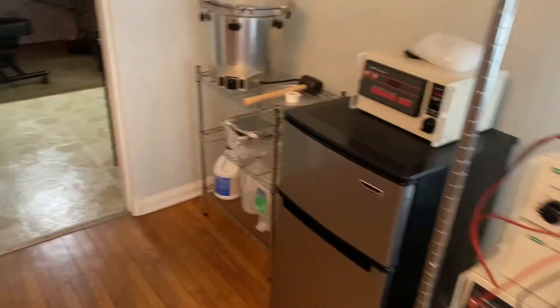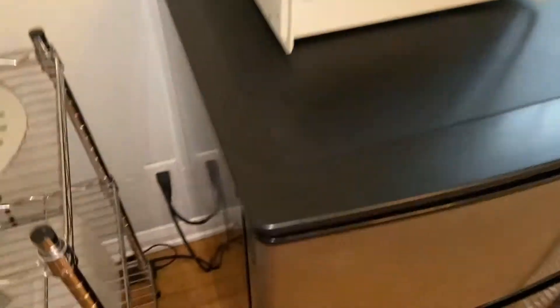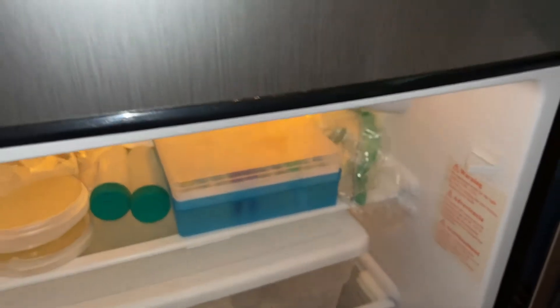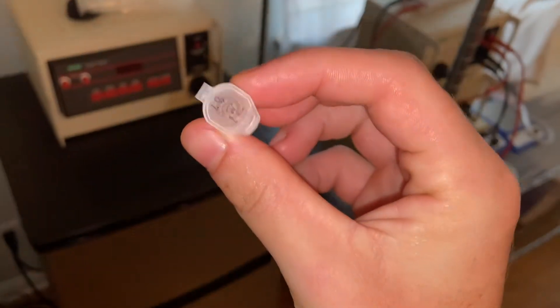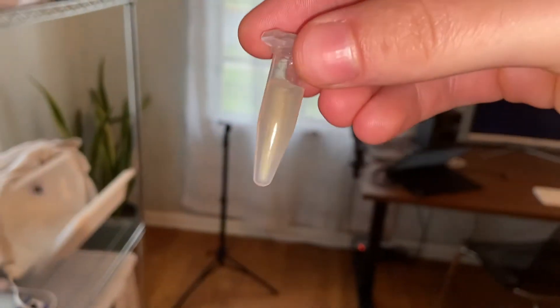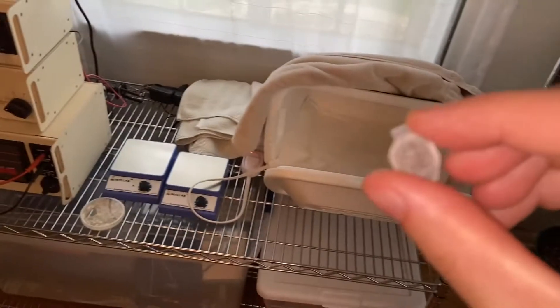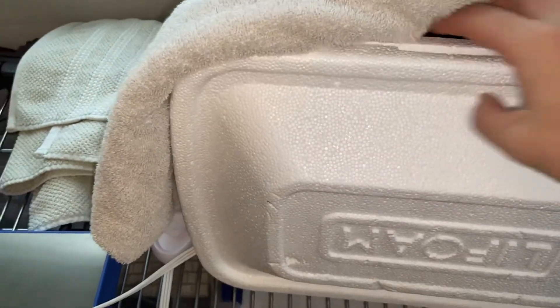What we're going to do today is continue our electroporation work. To do that, we're going to need to take out a stab of DH5 alpha that I made some time ago. This is marked 12 weeks, but it's actually been about 15 weeks since I made this stab. To give it a little bit of a chance to recover, I'm going to place it into the incubator for a couple of hours.